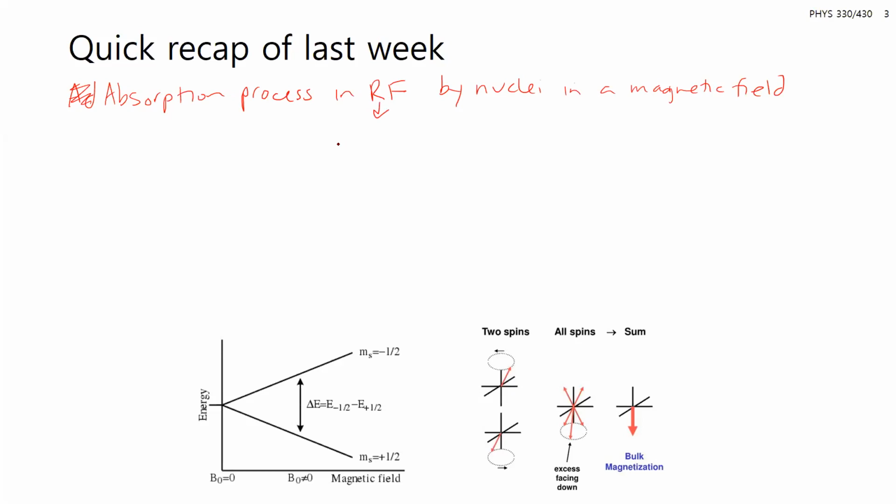Where this radio frequency range that's used in NMR is less than 10 to the 9th hertz, or that would be wavelengths of greater than 0.3 meters or so. That region of the electromagnetic spectrum with the addition of this magnetic field.